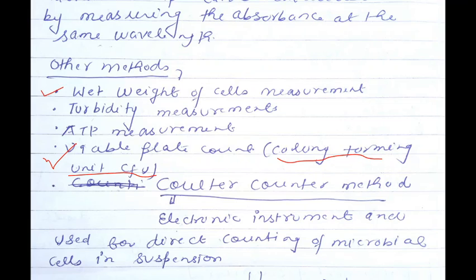After solidification, you can take 200 or 100 microliters of the culture, it depends on you. Keep in mind that if you take a 100 microliter sample, you mention the CFU, colony forming units, in 100 microliters, and if you take 200 microliters, then you note the colony forming units in 200 microliters. You see how many colonies are produced on a plate, count them manually, and calculate the CFU, colony forming units.